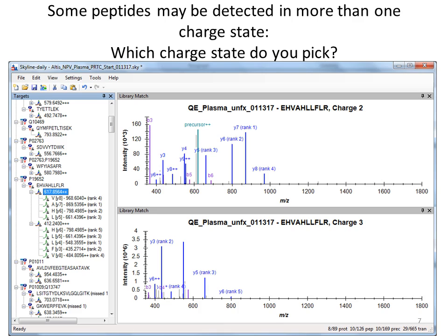So if you need sequence information, then you need to fragment that peptide, and there are tricks on how to do that. If you need site-specific information about that modification, then that's another matter, and you've got to concentrate on that experiment. Working with samples that have an abundant amount of that target present is good, because then you can do some optimization, or ideally, if you can afford a standard, then you would want to play around with that.